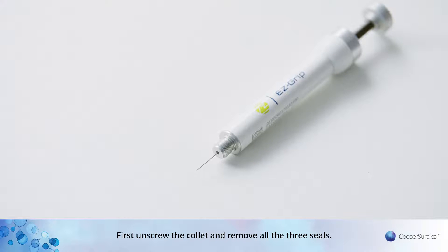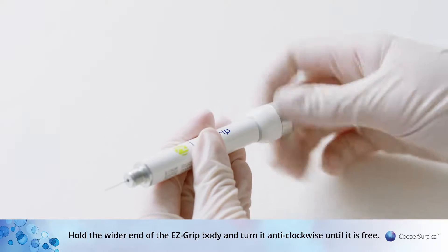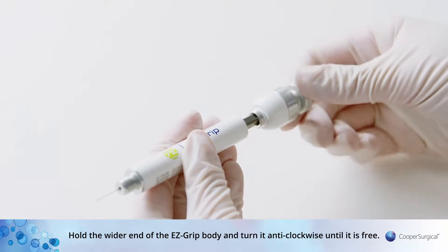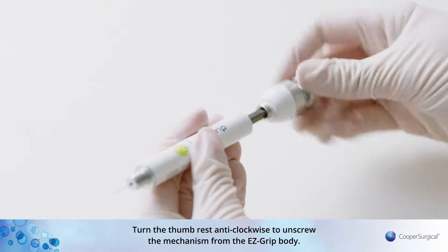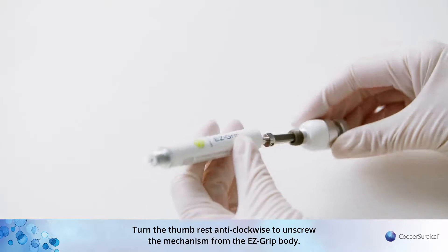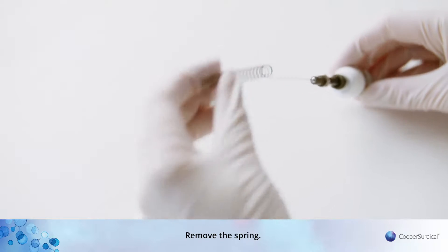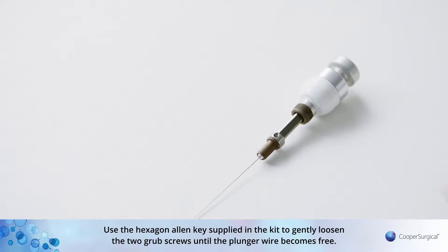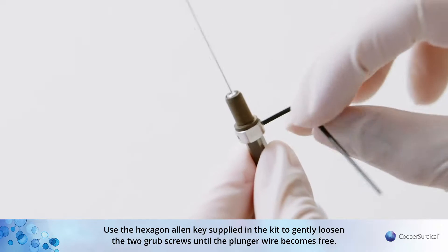First, unscrew the collet and remove all three seals. Hold the wider end of the EZ-Grip body and turn it anti-clockwise until it is free. Turn the thumb rest anti-clockwise to unscrew the mechanism from the EZ-Grip body. Remove the spring. Use the hexagon allen key supplied in the kit to gently loosen the two grub screws until the plunger wire becomes free.